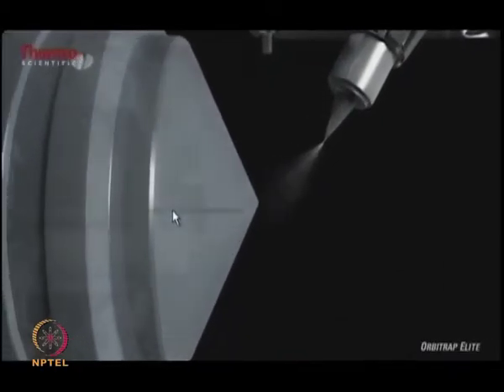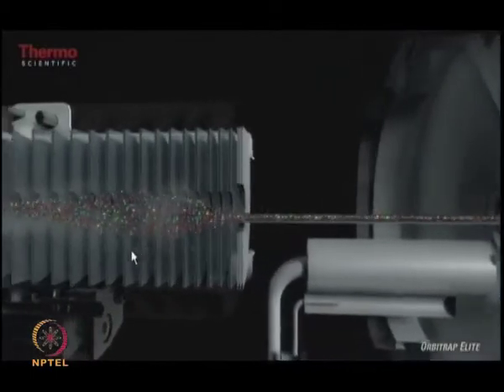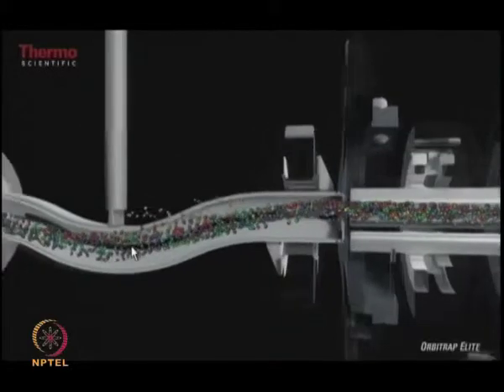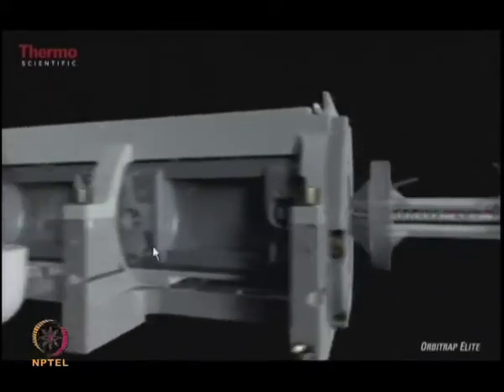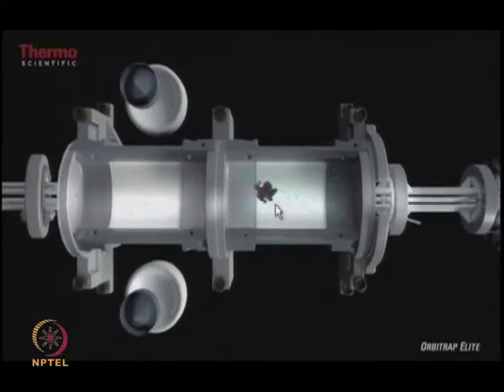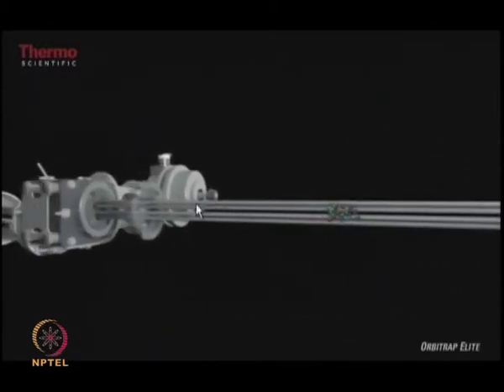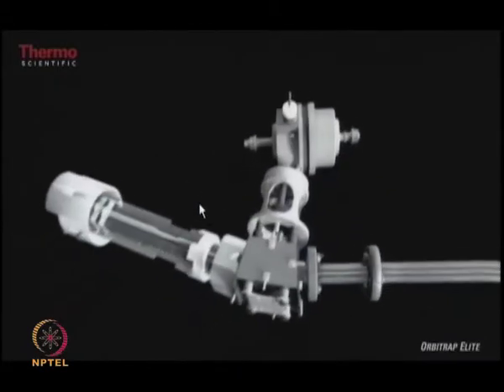So coming back to the ionization source, the ions generated from the source go into the transfer optics. After going out from the transfer optics, they go to the linear trap. In the linear trap, in full scan mode, the ions are stored in the high pressure cell. Once the ions are stored in the high pressure cell in full scan mode, they are then transferred to the C trap through the ion transfer optics.